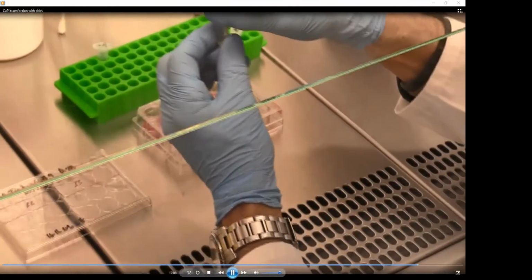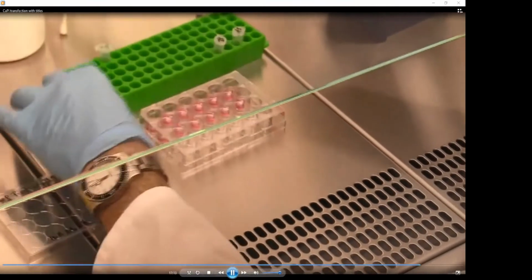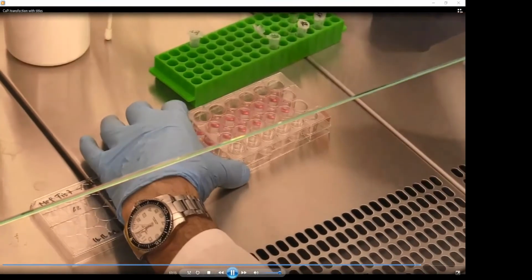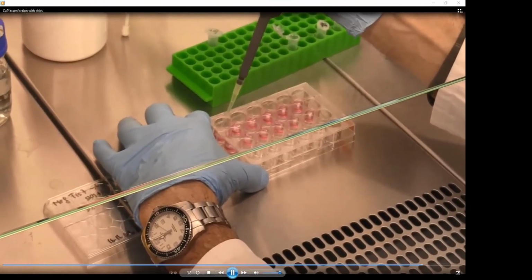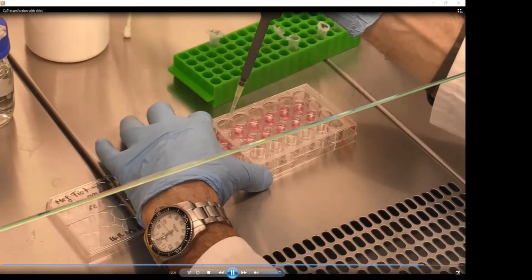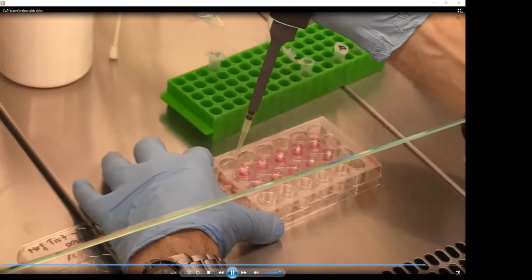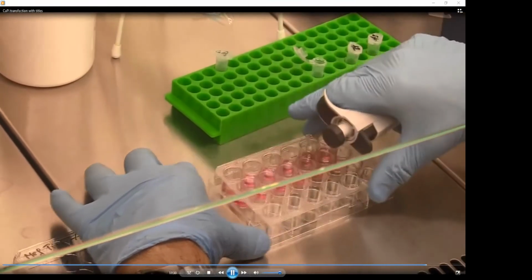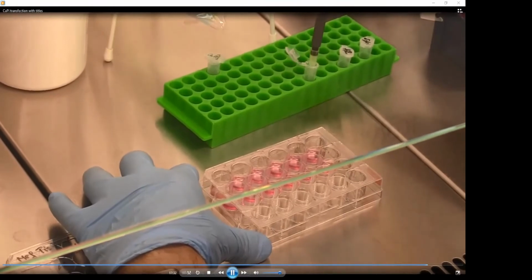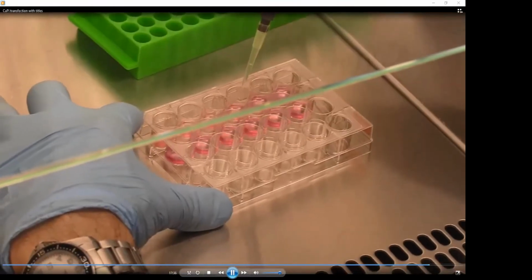So now we add the mixture, once again dropwise, and important is to know how much. So it's 80 microliters of the transfection mix per well. And don't rush in this step, do it always dropwise and try to distribute the sample all over the well so that it gets the best chance to interact with all cells in your well.